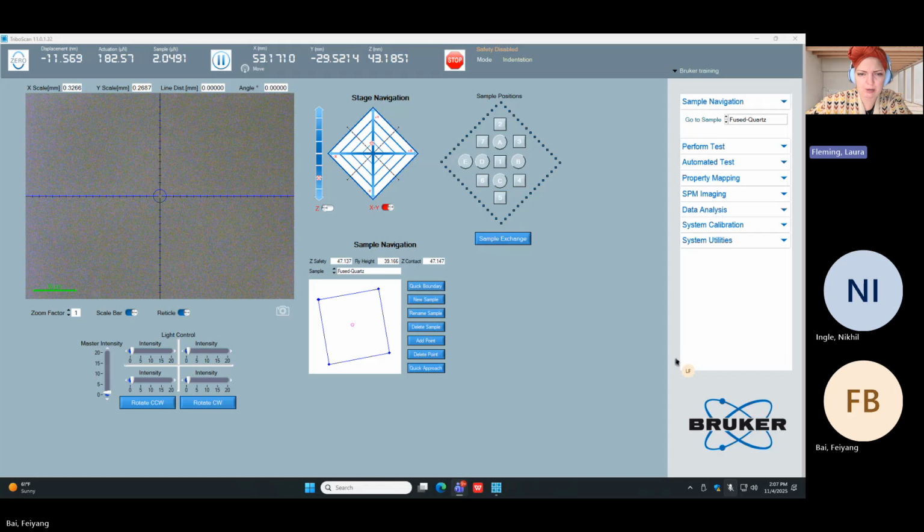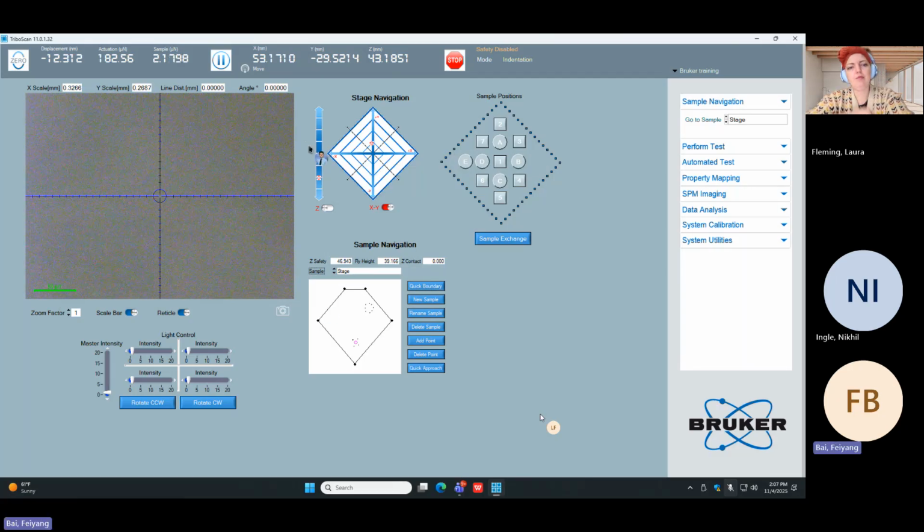So what I'm going to have you do, sorry, I'm just going to check something here. On the stage, I can tell where your samples are. You're in here. Can you focus on the stage on this sample zone? Focus the stage on like here. We're going to use the stage as a fake sample.